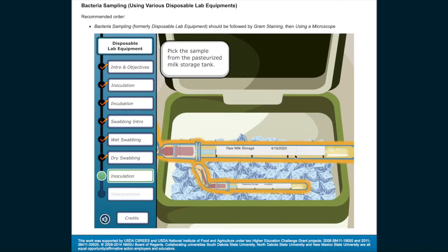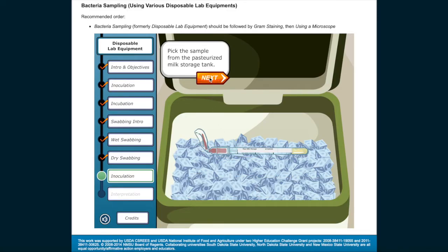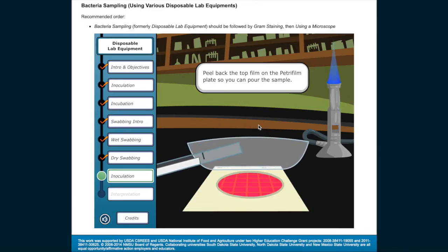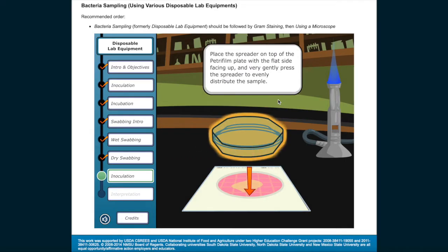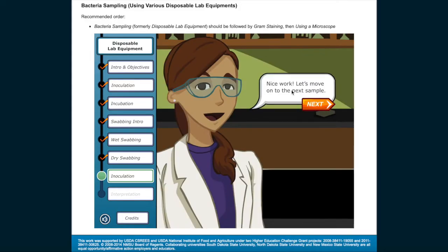Pick up the sample from the pasteurized milk storage tank. Peel back the top film on the Petri film plate so you can pour the sample. Now gently drop the top film onto the sample — this prevents air bubbles from forming. Place the spreader on top of the Petri film plate with the flat side facing up, and very gently press the spreader to evenly distribute the sample. Nice work!